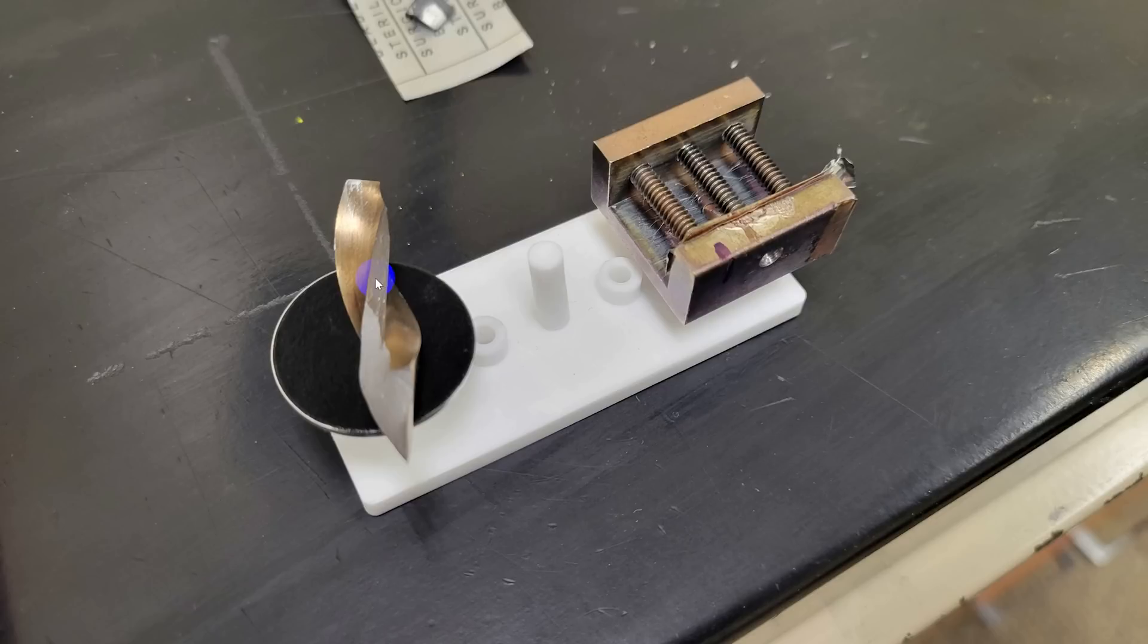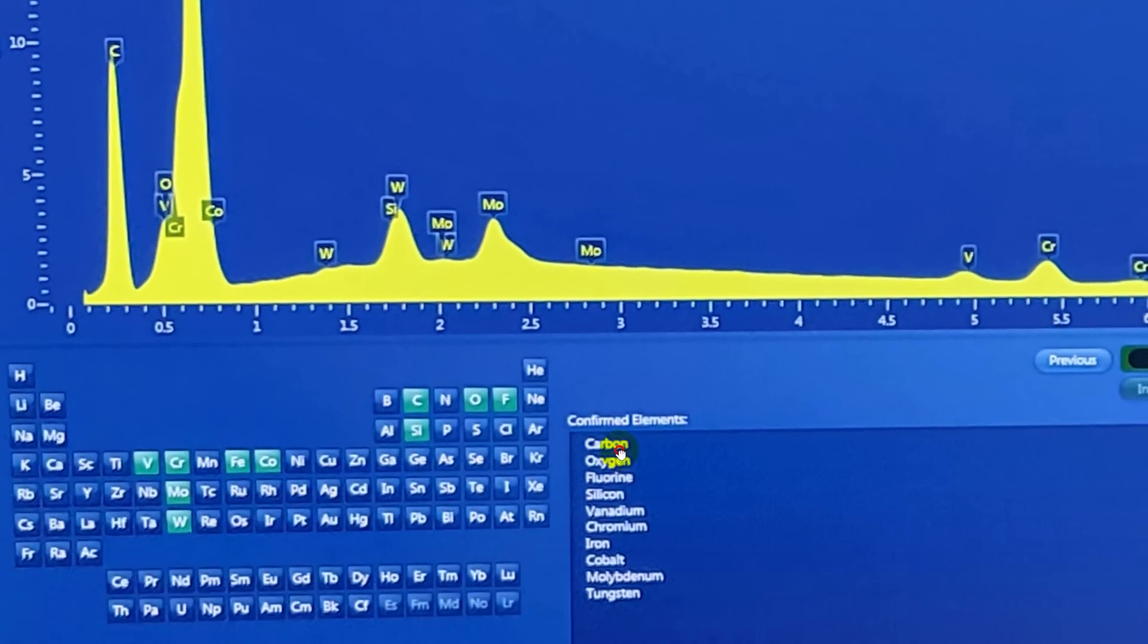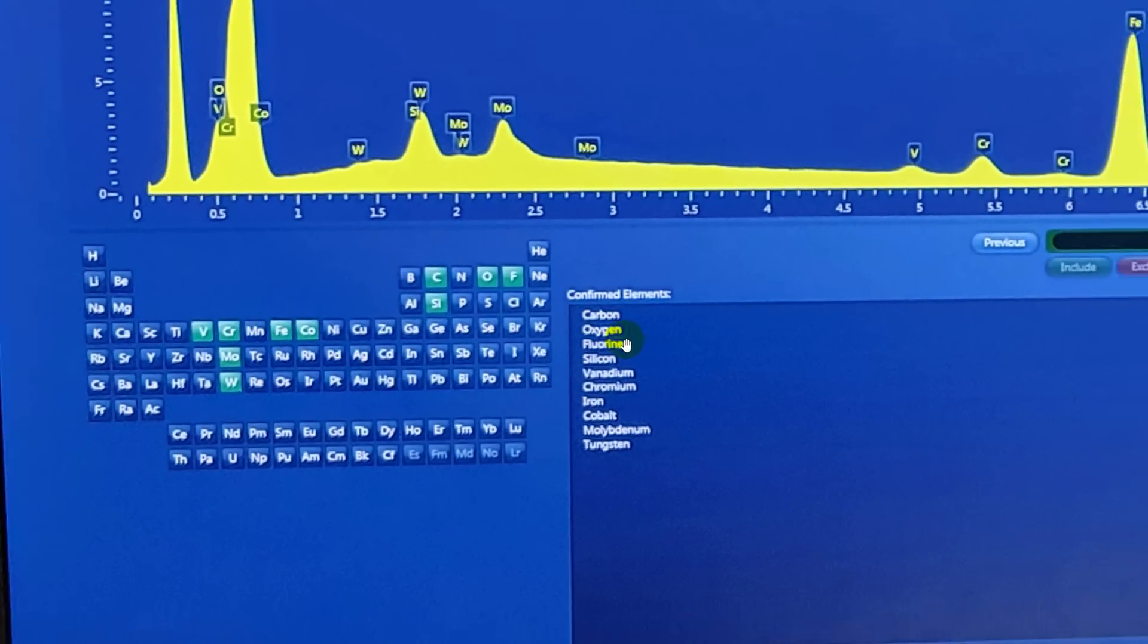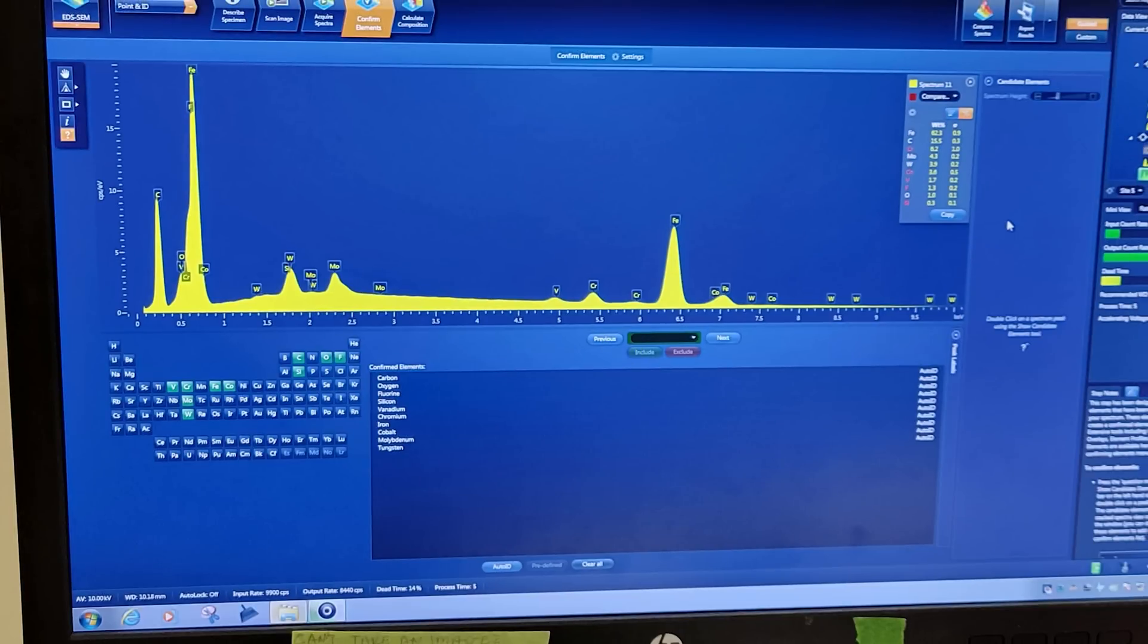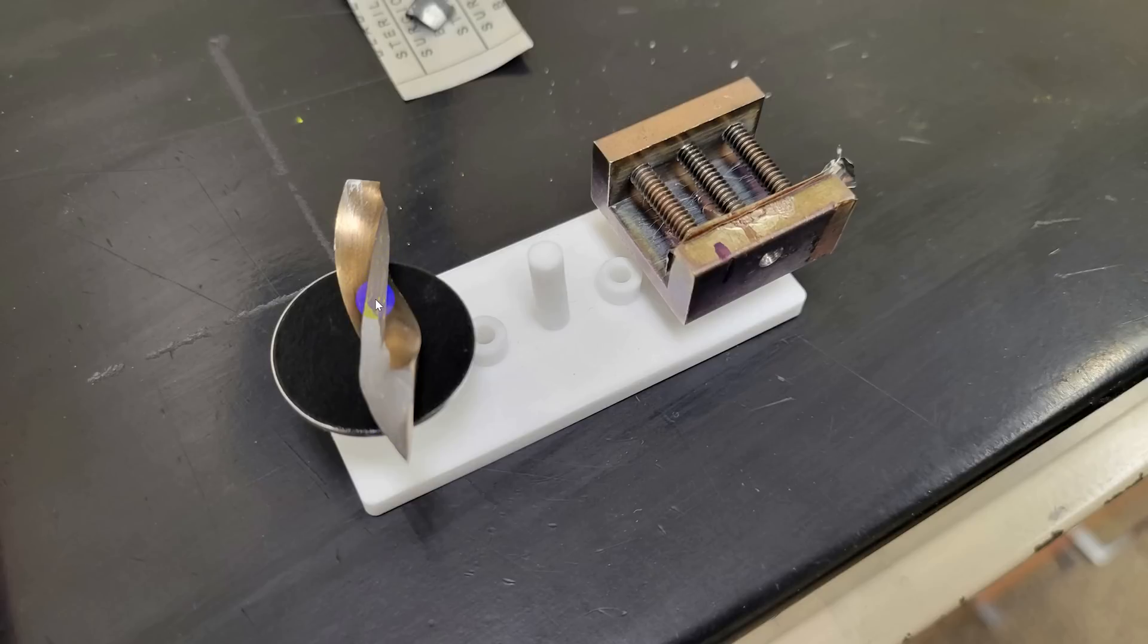Our hypothesis being that this portion was broken while I was using the drill and this dark area was broken during manufacture. So let's go take a look at the spectrum in that dark area. The spectrum in the dark area looks almost exactly the same except for right here, this little O is oxygen. There is oxygen present here. It's something like six to eight percent. And in fact, if we overlay the two samples on top of each other, that is really the only difference, that little bump showing the oxygen. So what does that tell us? It tells us that this is indeed an oxide coating. It's not some other kind of coating. It's nothing else deposited, because the elemental analysis of this matches except for the oxygen. So all that is is that's just an oxidized area on the drill. And in fact, if you move over and take a sample from the parts that should have been on the exterior of the drill, it matches exactly.